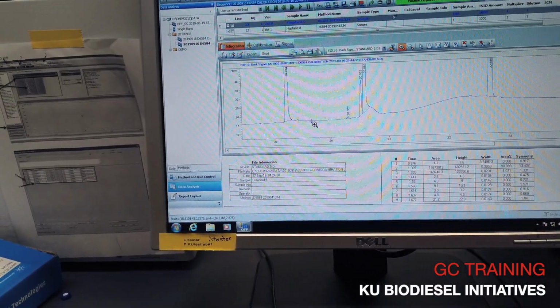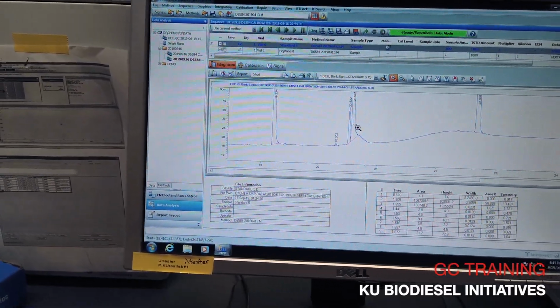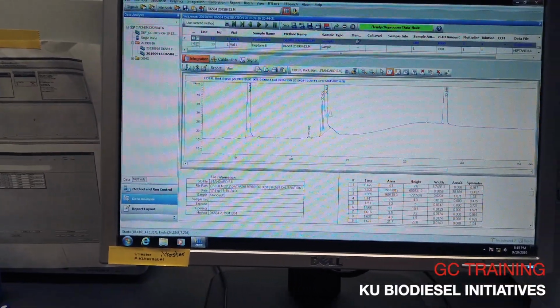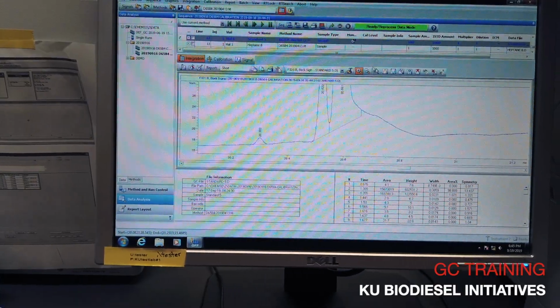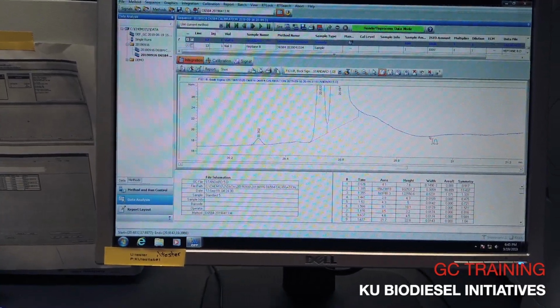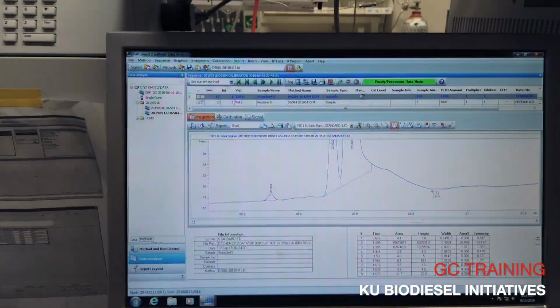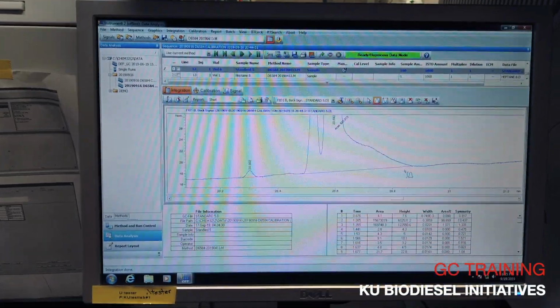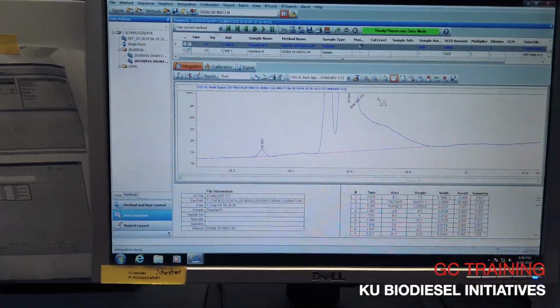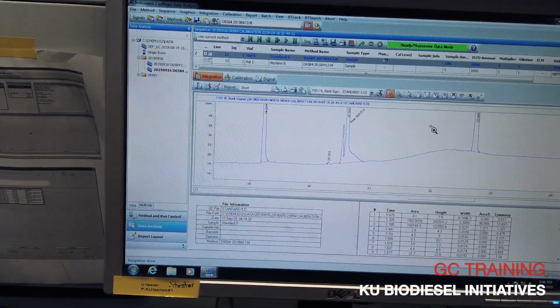So the only thing that's kind of concerning me here is that I see a lot of tailing. So like this, for instance, looks kind of wonky to me. So I guess I'm just gonna go from here to here, because here's the thing though, it's also kind of based off of perspective. You know, this might look really weird because you're super zoomed in. Because normally, for instance, see, this peak area is only 823 units. Or area counts, I guess. Sure, we'll call it area counts. So that's not astronomically high.